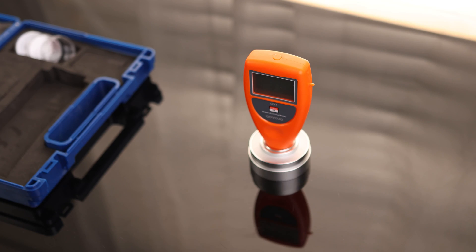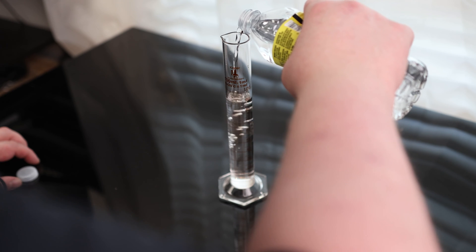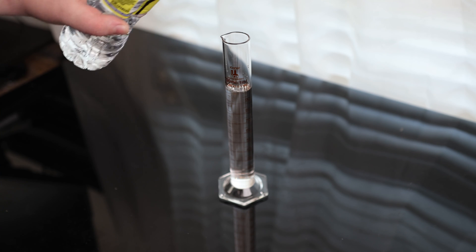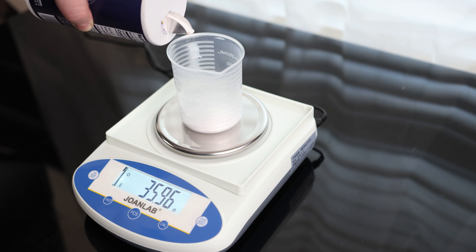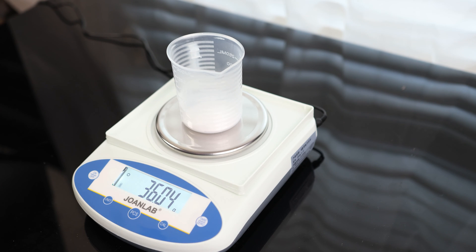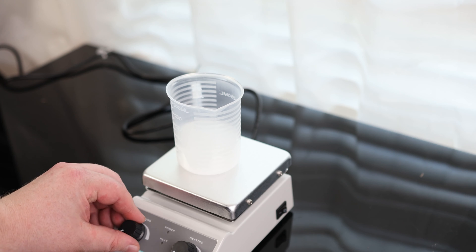The first thing we want to do is make sure this is calibrated. You can buy your own solution for calibration, or we can make our own. You can get 100 milliliters of purified or distilled water, and the next thing we're going to need is 36 grams of salt. We're going to add the water to the salt. You don't need a fancy stir like this — you can do it by hand — but I've got one so I'm going to use it.